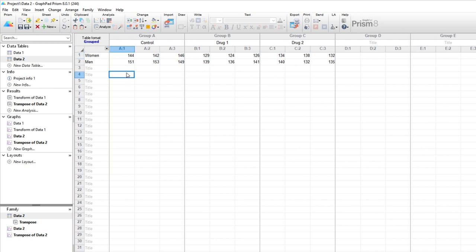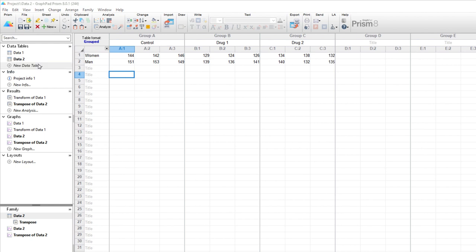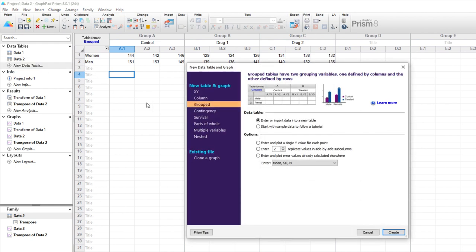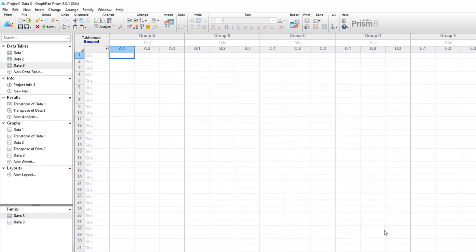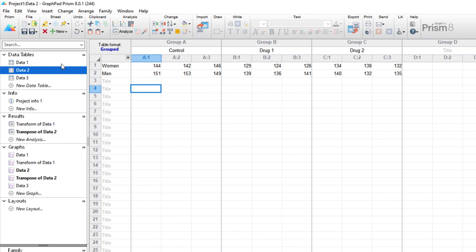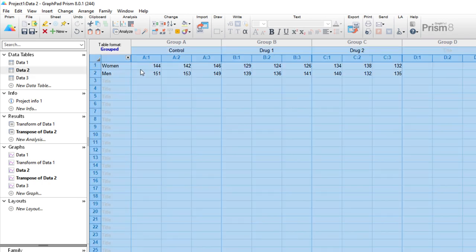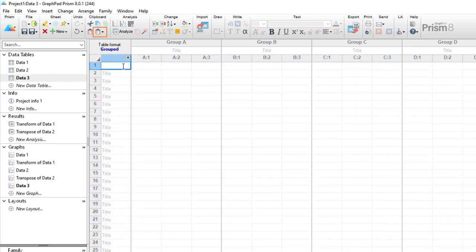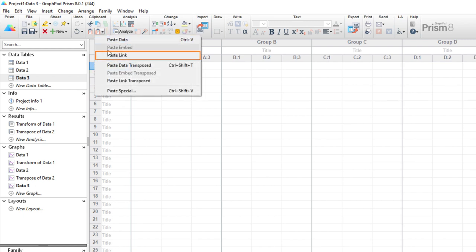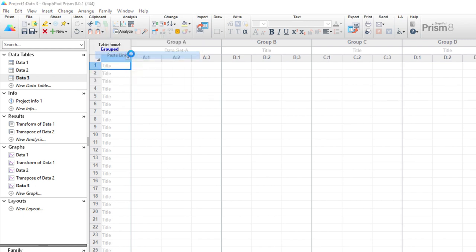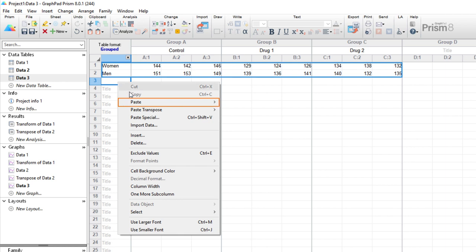The first of these features is the paste link function. Once you've copied data, in addition to simply pasting the data itself, you can also choose, depending on the data source and your operating system, to paste the data and keep a link to the source data file. Let's explore an example. Continuing on with our current Prism file, we can create a new data table. We'll keep it grouped with three replicates. Let's go to our first data table and copy our original values. Go back to the new data table and click the paste special button in the toolbar. From here we can choose paste link. You can also find the paste link option by right clicking and selecting paste, paste link.